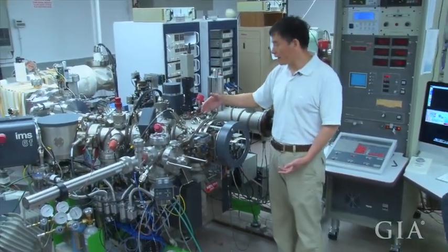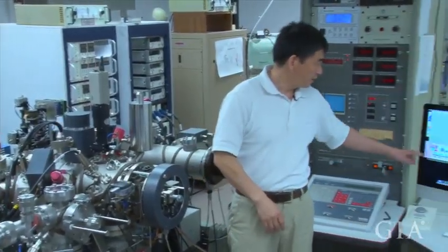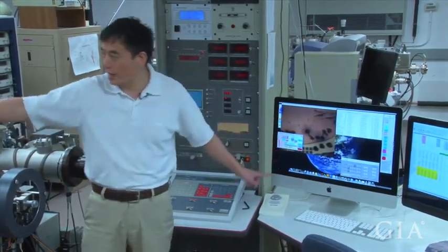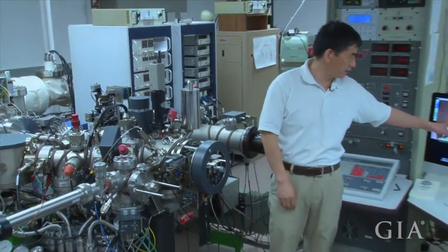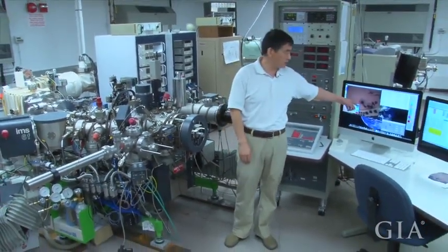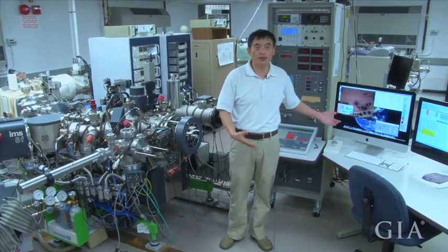Secondary ions are the ions generated after your sample gets hit. Your primary ion is the ions coming from there that's been accelerated and focused and hit on this target. The target then generates secondary ions.